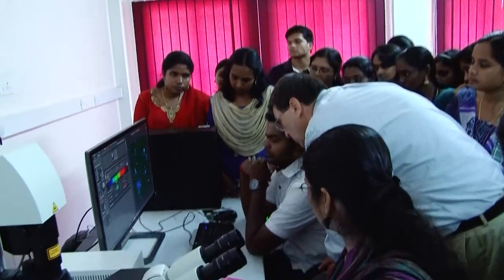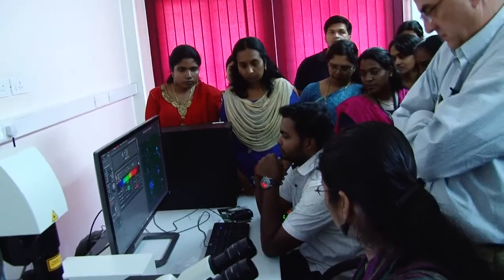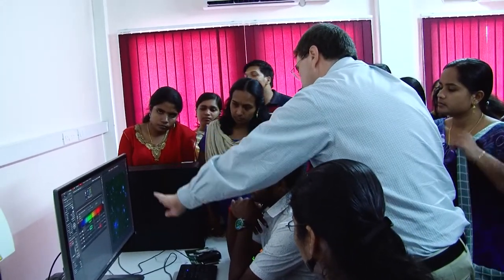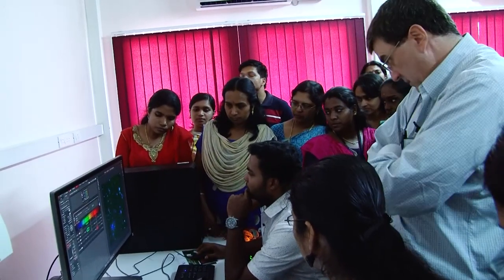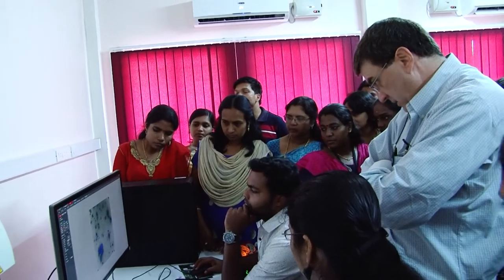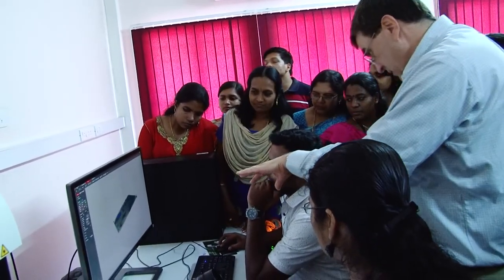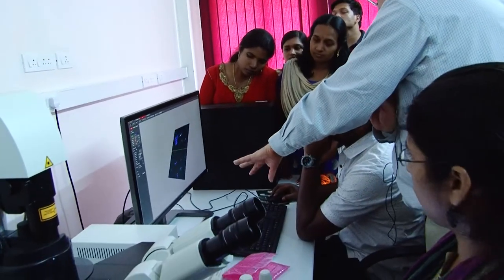Now, can you look at it like in 3D? Can you do like a 3D projection? Yeah. Okay, okay. See, was sort of in focus, now it's out of focus. Some of the other ones are in focus, out of focus. Okay, so it ran the stack. Now what he's doing is a 3D projection, okay? Remember we talked about 3D? So now he's looking at it in 3D.